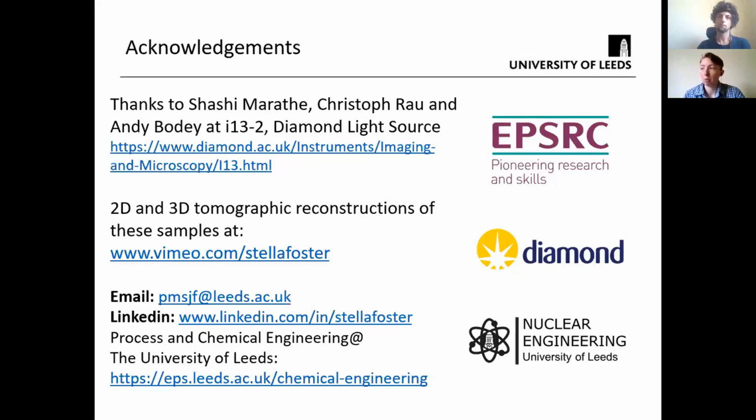I believe it was originally created for biosciences for applications like cell counting, something like that, but it's excellent. I recommend it. It's very easy to get it to distinguish between two phases. As you saw in my images, the contrast isn't brilliant, but it does a great job. I can't show you the data I have on that, but I verified that it was very similar to what I had shown you through this thresholding method.